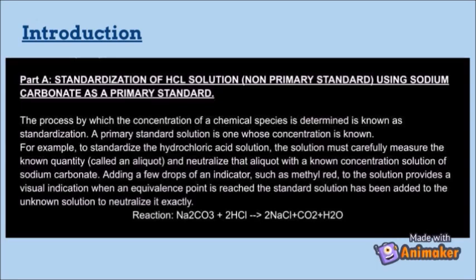Introduction, Part A. Standardization of HCl solution, non-primary standard, using sodium carbonate as a primary standard. The process by which the concentration of a chemical species is determined is known as standardization. A primary standard solution is one whose concentration is known.